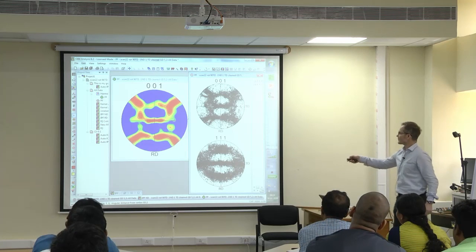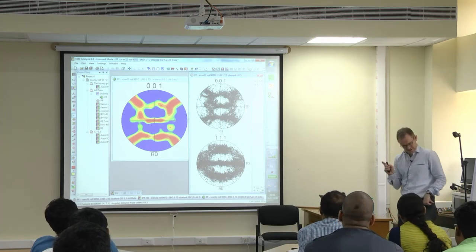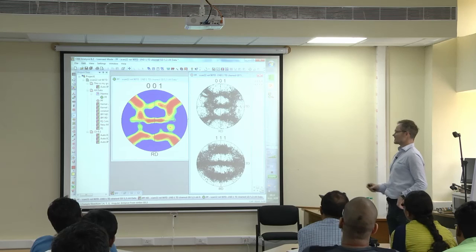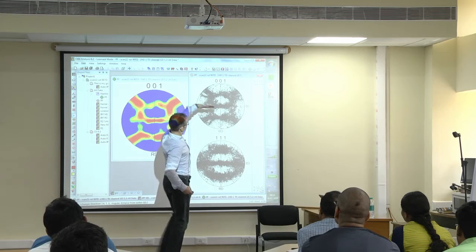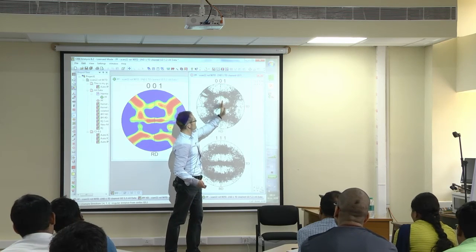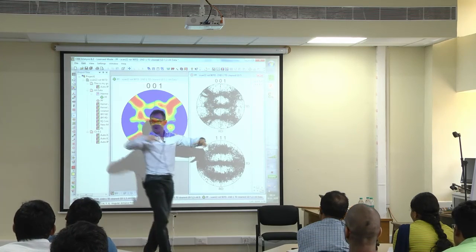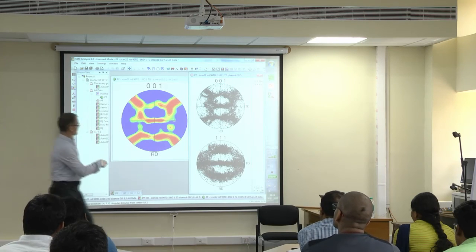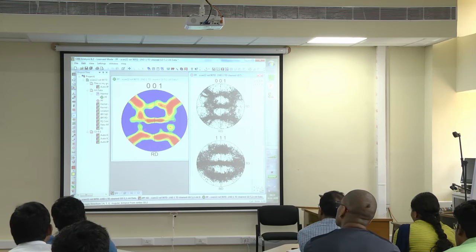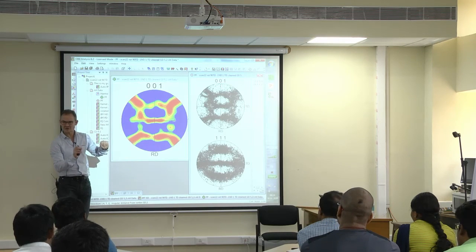This is the density distribution of this picture here. And interestingly, from this picture you would have said, okay, I think the rolling symmetry is clearly observed. I clearly see that there is a mirror plane here and a mirror plane here. So it looks as if I have measured enough data to really represent a nicely symmetric texture, which for me would be a sign I have measured enough. But if you calculate, then you see actually that the density here is not as high as the density here. So it's not symmetric. It's getting approximately symmetric, but it's not yet purely symmetric.